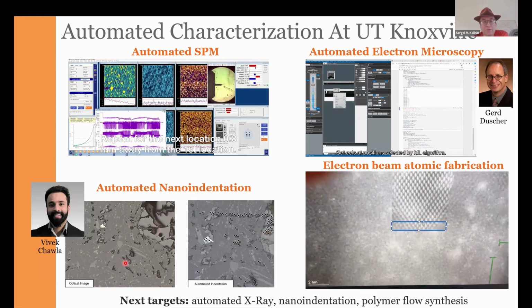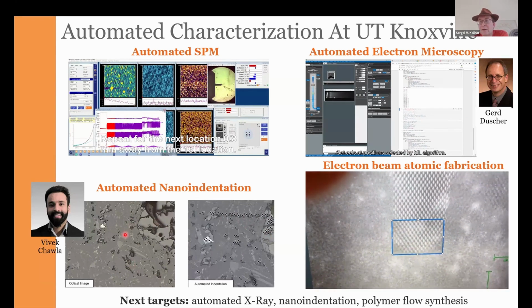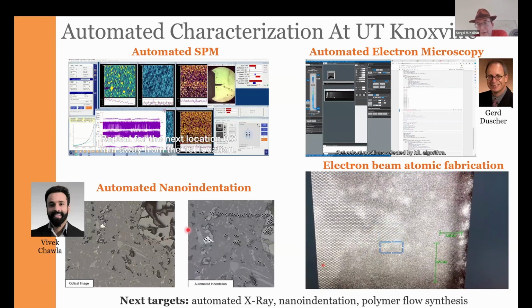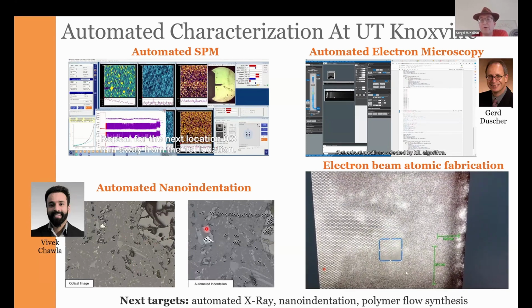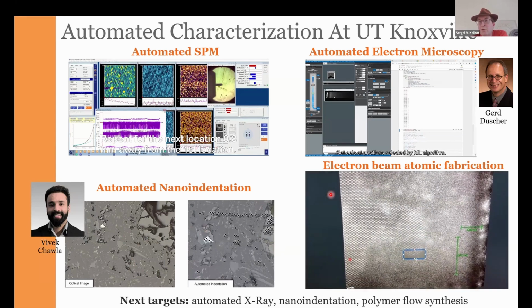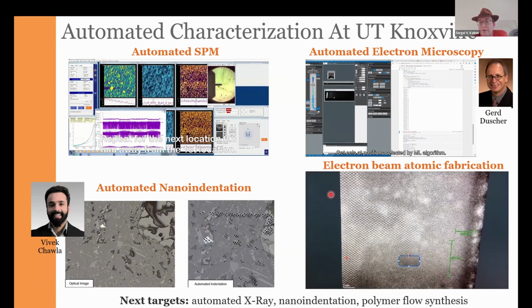And we can determine what is interesting based on the SEM signal, EDS, or any type of structural or chemical metric. And of course, I'm not going to talk about it in detail, but with the automated microscopy, you can do more than just study material. You can also make material.